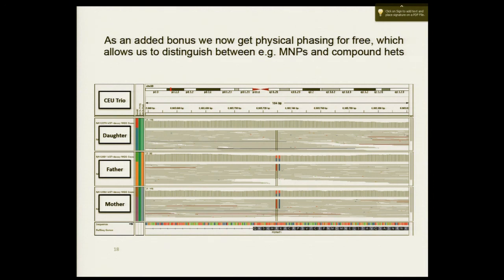So what would come out of the haplotype caller is, the reference would be blue, red, red goes to red, red, blue, right? It has to be on the same haplotype. Yeah, it has to be on the same haplotype.